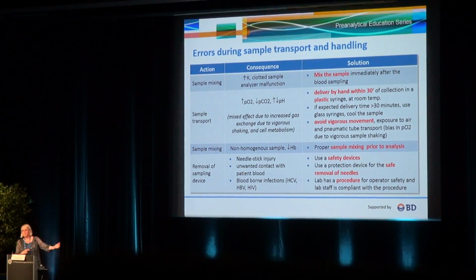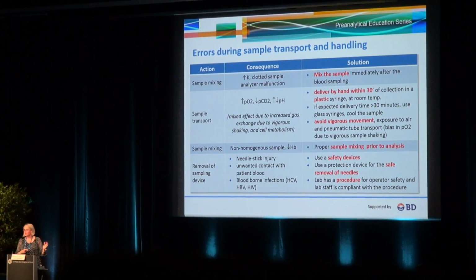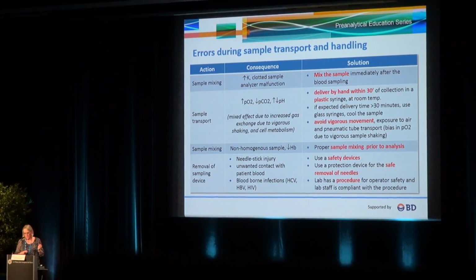After your sample has reached the laboratory, then again, depending on the time from the sampling and the analysis, you should again mix your sample once again prior to analysis to ensure that your sample is homogeneous. And so again, mixing should be done as I showed you. And mixing should be longer if you notice that the sample has been visually sedimented. So if there is already a sedimentation occurred in your sample, then you should mix your sample longer than just a couple of rotations.